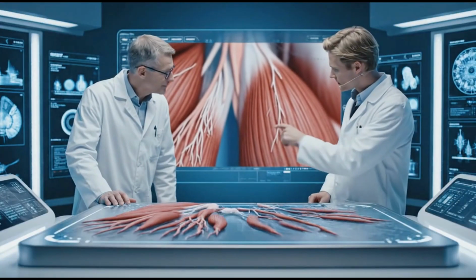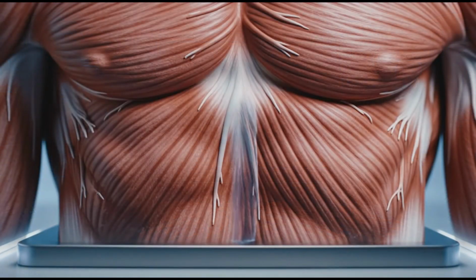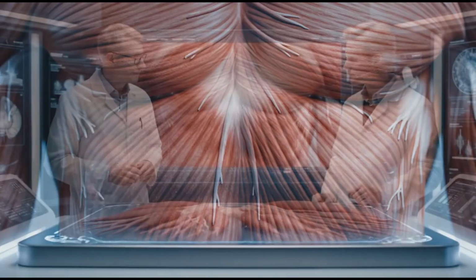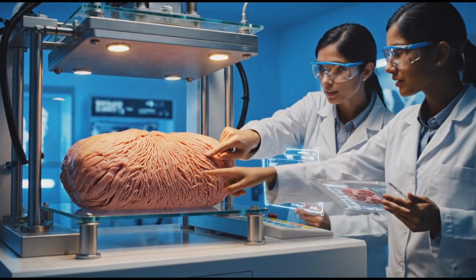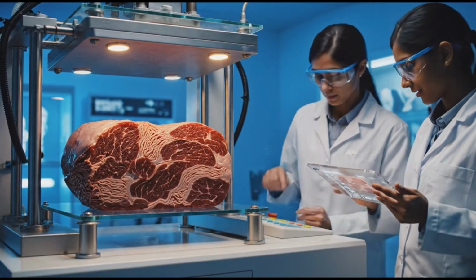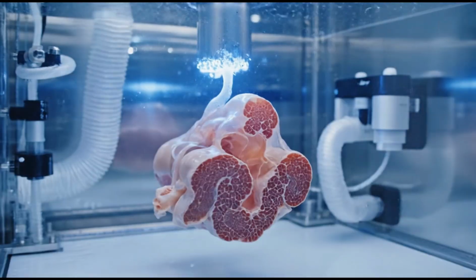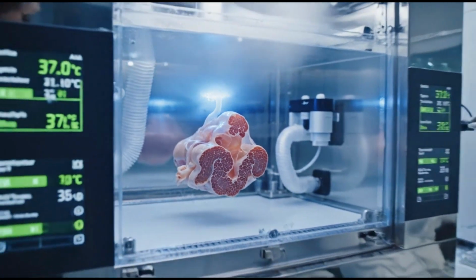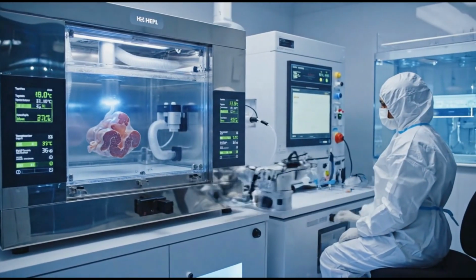The density has improved significantly. Yes, successful response confirmed. Maturation environment maintains optimal temperature and humidity. Airflow regulated automatically.